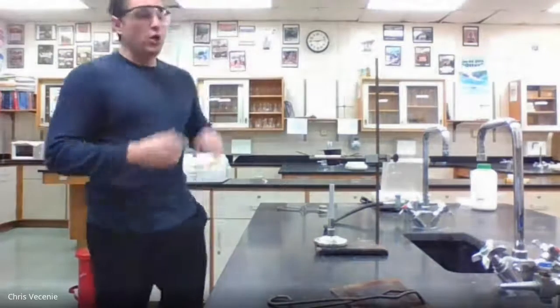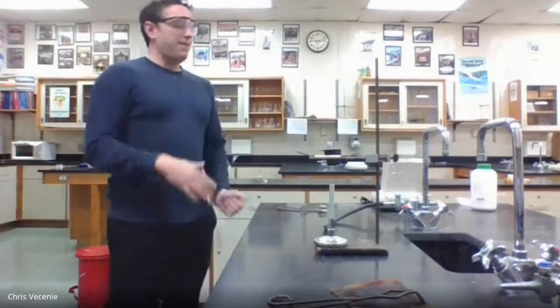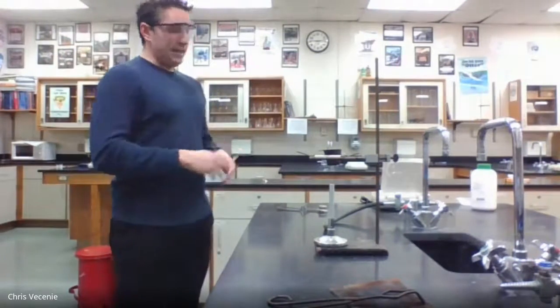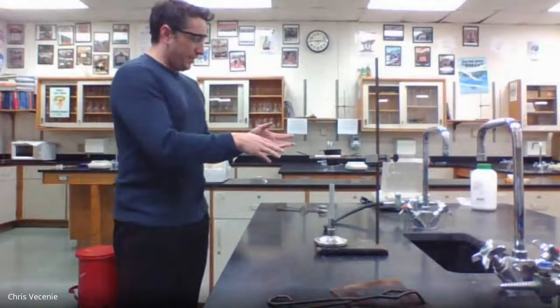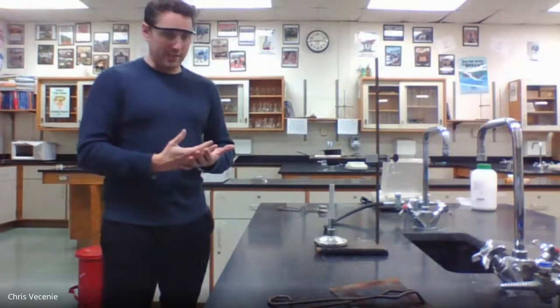Here is why. You know from beginning to end that it's supposed to get lighter because the oxygen's leaving. If I reheat it, mass it, and it keeps getting lighter, it means there's still oxygen leaving. I'm not done yet. But if I get the mass of it, reheat it, cool it, and get the mass again, and those numbers are the same, it means there's no more oxygen to leave. It's the indicator that you're done with the decomposition process.